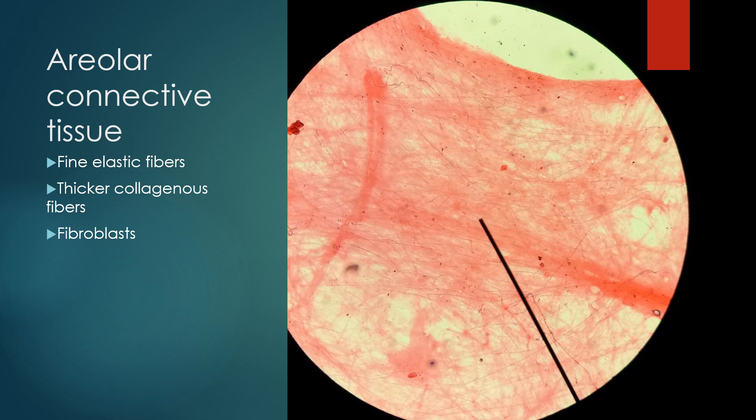Number eight was areolar connective tissue. These very fine fibers are the elastic fibers, and they'll be kind of chaotically arranged rather randomly. Then the thicker fibers that you see are going to be collagen fibers. The cells, if you see cells, they're going to be fibroblasts.